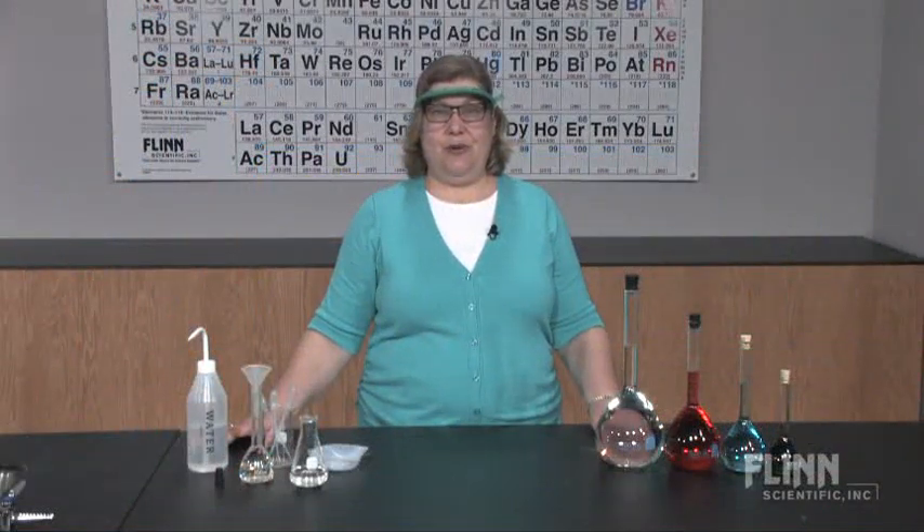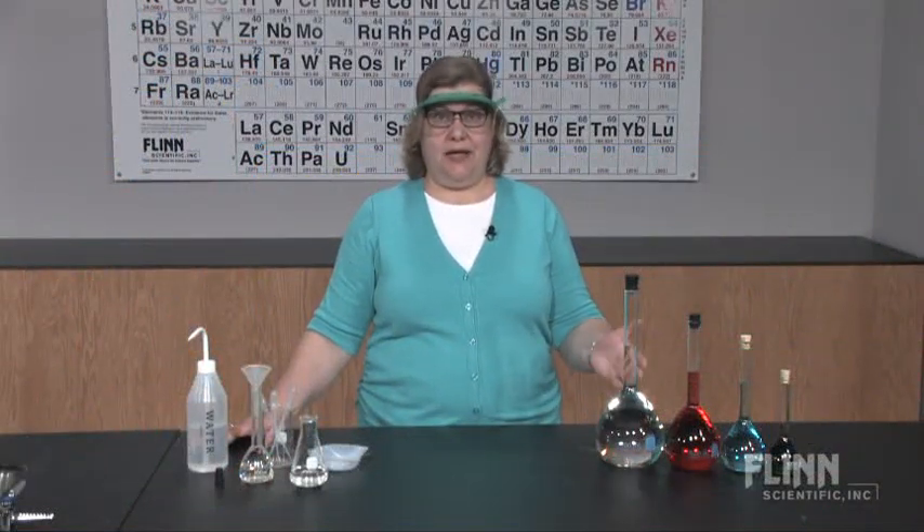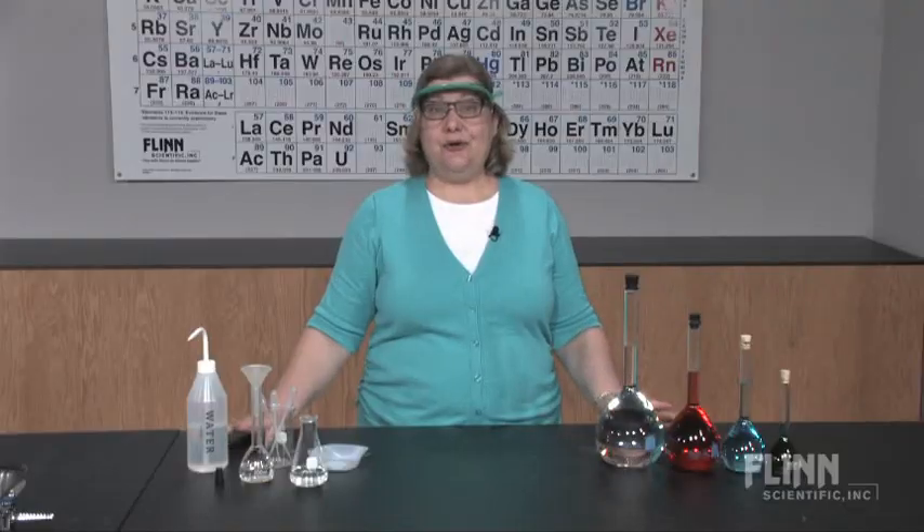The unique design of a volumetric flask, with its wide body and narrow neck, allows for extremely high accuracy when preparing solutions.